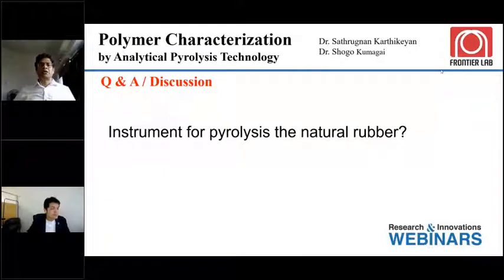Yes, I think we can use normal Py-GC/MS for natural rubber analysis. Yes, next one. And those are the questions we have now.